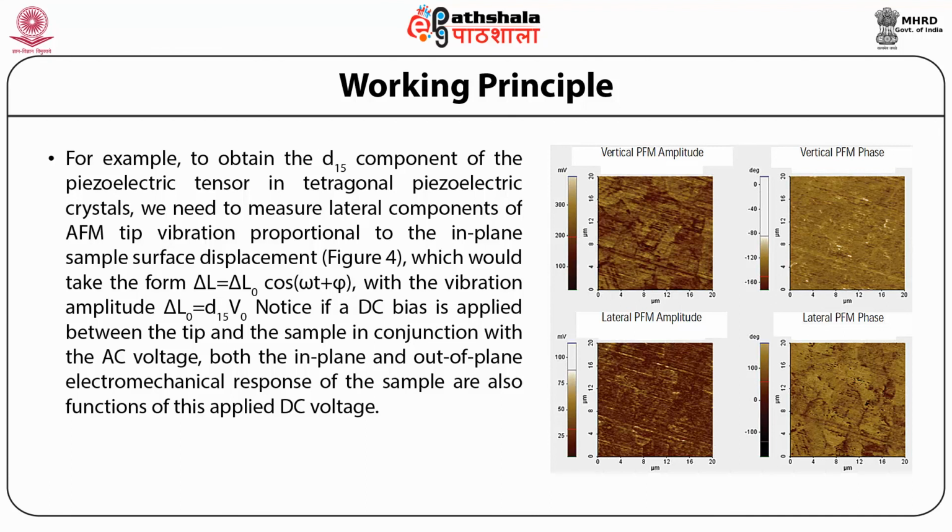Now notice over here, if a DC bias is applied between the tip and the sample in conjunction with the AC voltage, both the in-plane and out-of-plane electromechanical responses of the sample are also functions of this applied DC voltage.